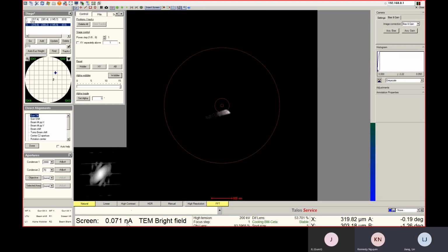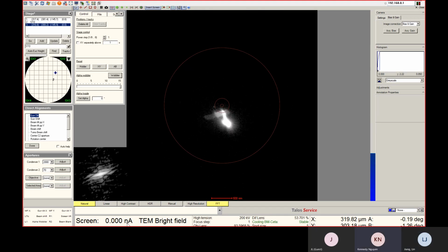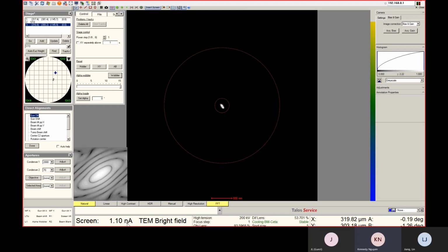When you feel good, you can say stop. So 104 seemed to be the highest. Okay, no, 111. So I'll go back to 111, 112, 113. Okay, here will be the biggest.